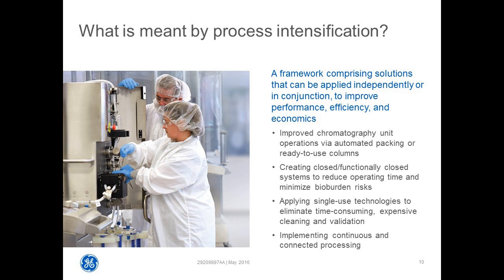Right? So this is how I see process intensification: as a combination of all of these different technologies or solutions, which can be applied independently or together, as a way of intensifying downstream process operations, and therefore enabling processes to keep up with some of the changing market dynamics that we talked about in the beginning of the presentation. Right? So let's jump right in.